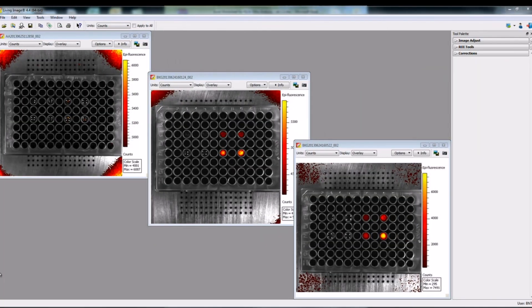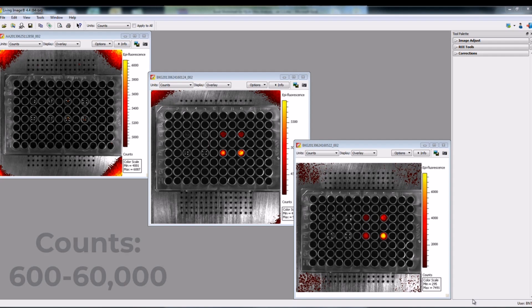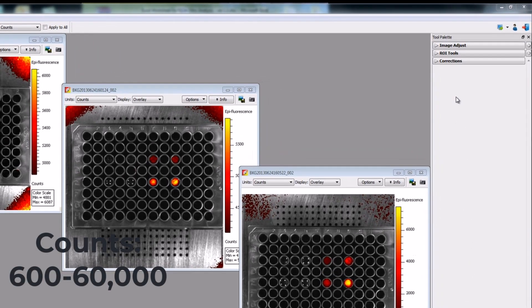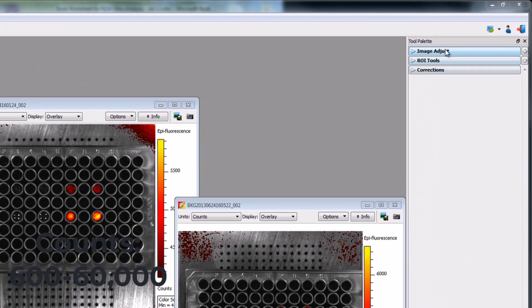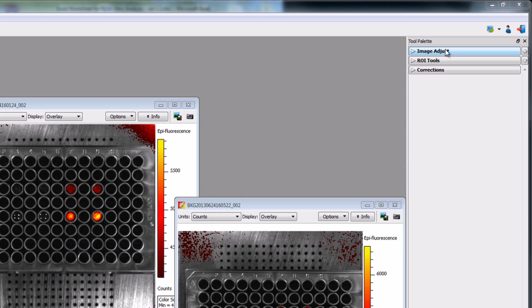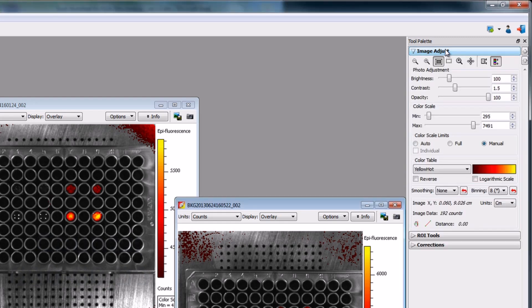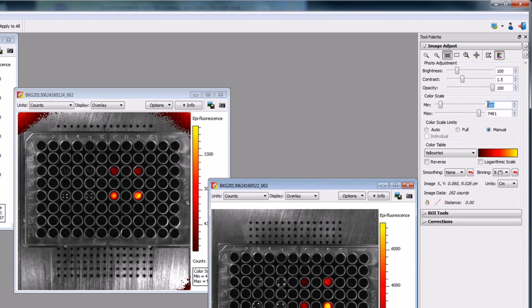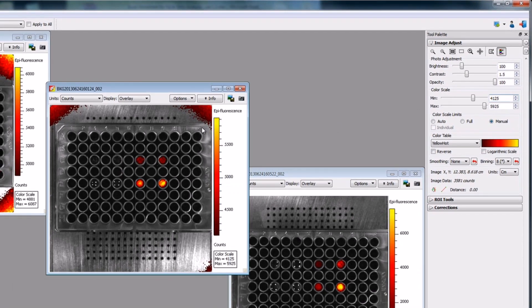After collecting data for all three probes, we will proceed with analysis. The basic workflow for analyzing fluorescence in well plates includes checking the quality of the acquired data by looking at the counts recorded. The image pixels should measure above 600 and below 60,000 raw counts. To check this, open the Image Adjust tab on the tool palette. Set the color scale minimum to 600. If the value is already above 600, you will see signal in the wells and there is no need to reacquire the image using more sensitive settings.